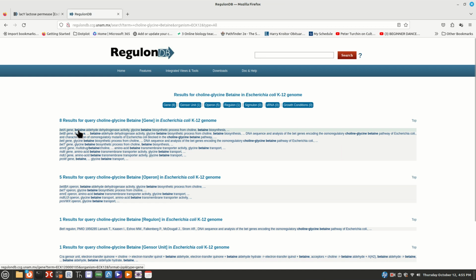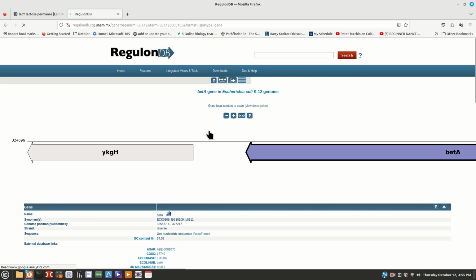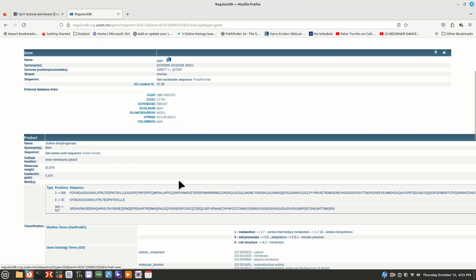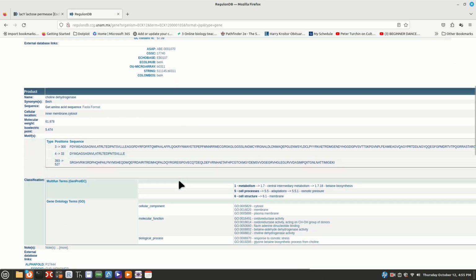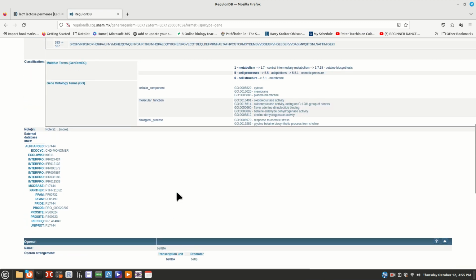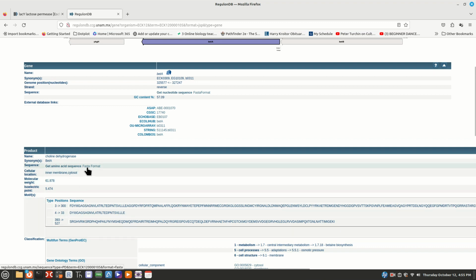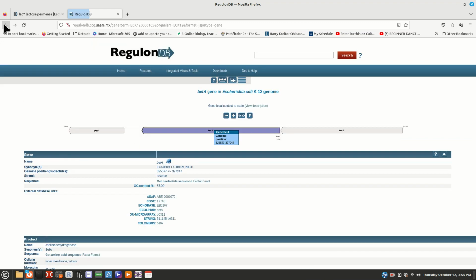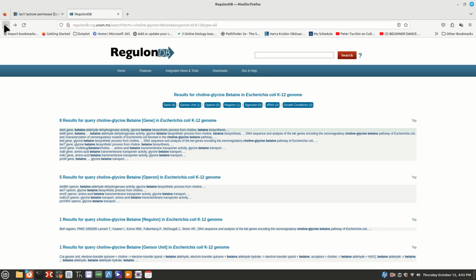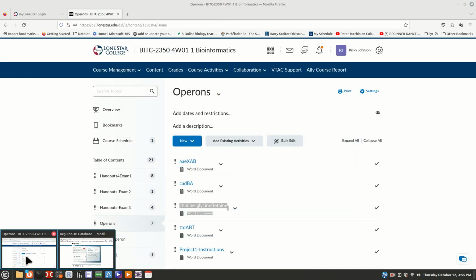Yes. So here you should be able to, for instance, find this. And here you've got your sequence, your nucleotide, and ooh, no amino acids. Amino acids are probably in there somewhere, but you can, yes, oh, I see amino acid. Oh, here it is. So yes, you can get your sequence for that one. So that should not be a problem. But let's try this last one here.